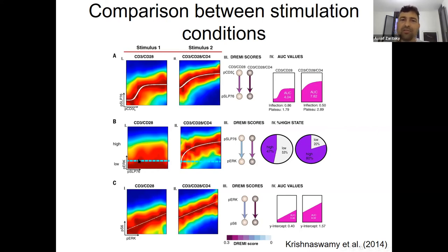Here is another example where you do not see a clear pattern, right? It's something very, very messy, there is no pattern here. You see you get very low values, but when you do this stimulation, when you do this perturbation, you suddenly get an increase. And you can also get similar. Okay, so that's the usage.